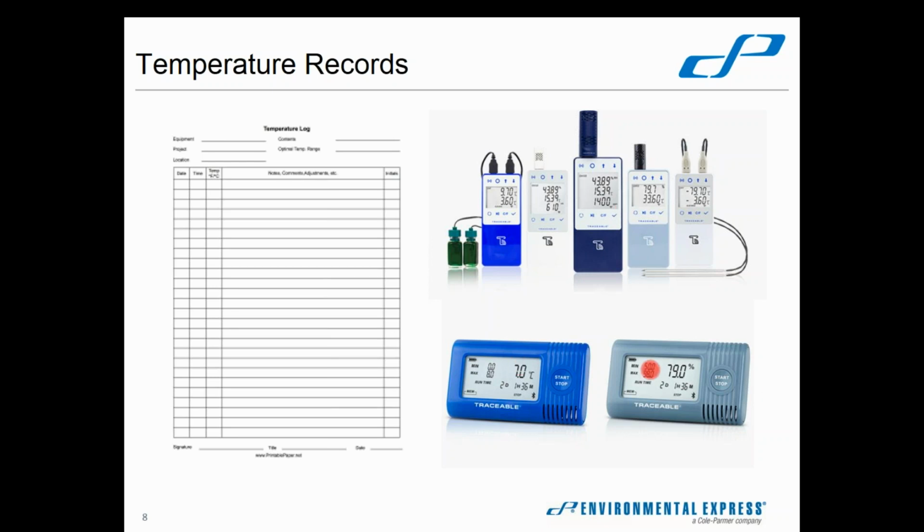And then the bottom picture here is something that I actually had not heard about until I was looking at it today. And I think it's really, really cool. This is called Traceable Go. And these are just about the size of, I don't know, some of those step trackers that you would attach to your belt. Old school, back before we all had our wristbands and smartphones that did it for us.